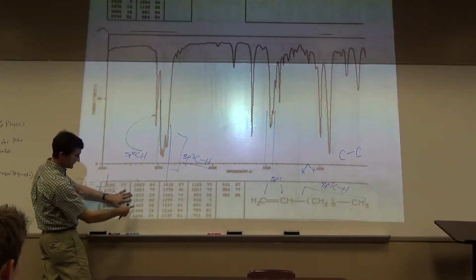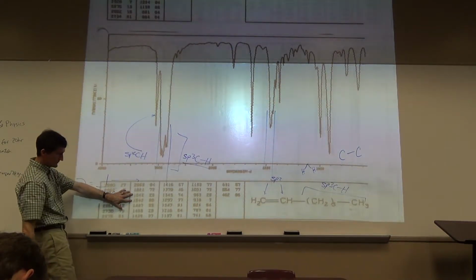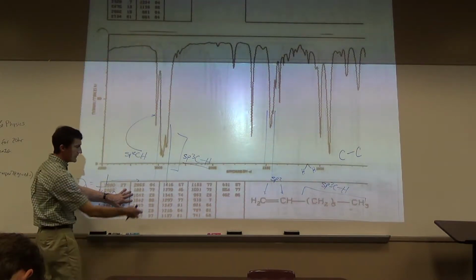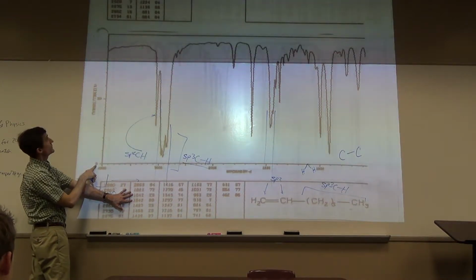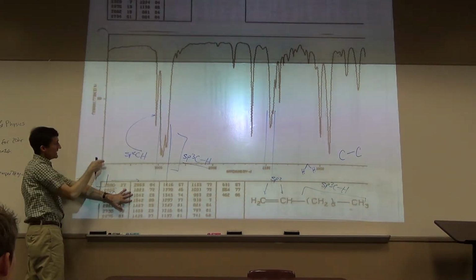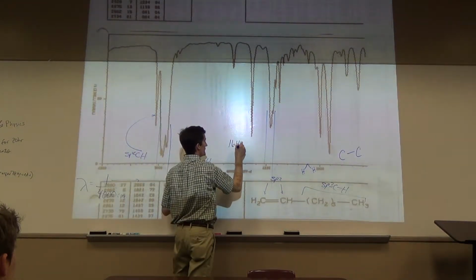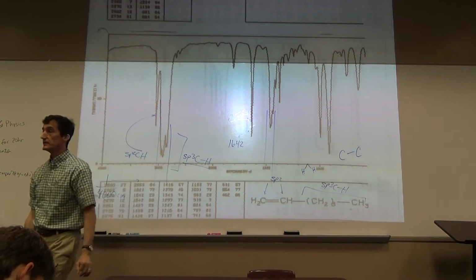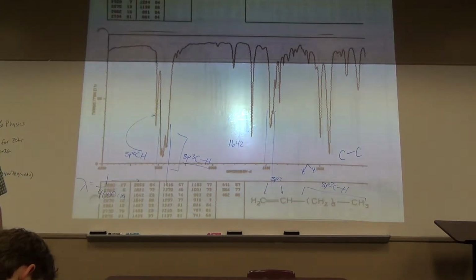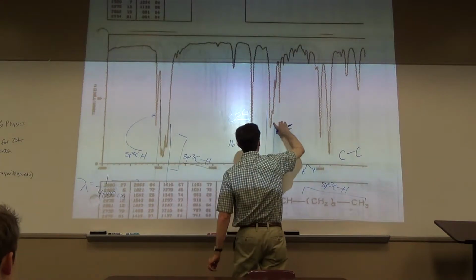I remember this from yesterday. It's almost like 1642. I don't know why there are two. This number is the intensity, and the more intense, actually the lower the number, because it goes from 100 down to 0. It looks like 1642 from the table, and that is your C-C alkene double bond. The rest is fingerprint.